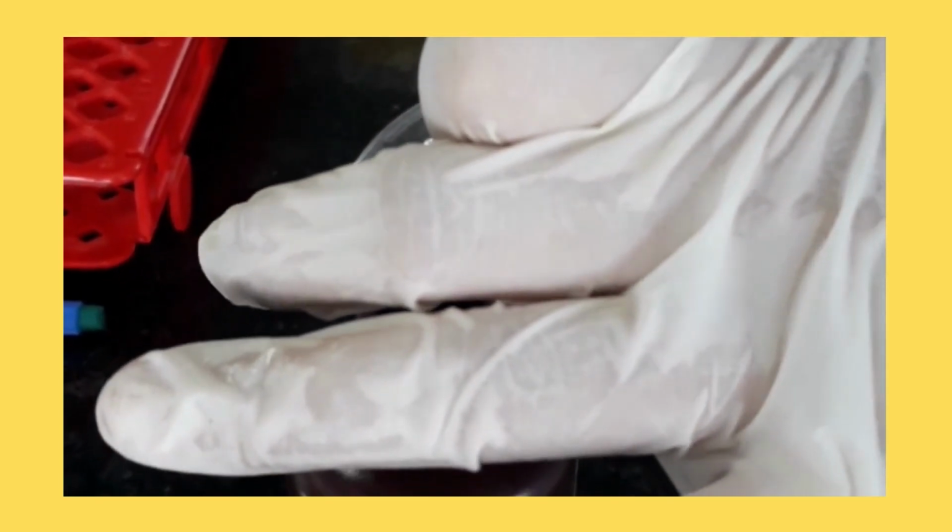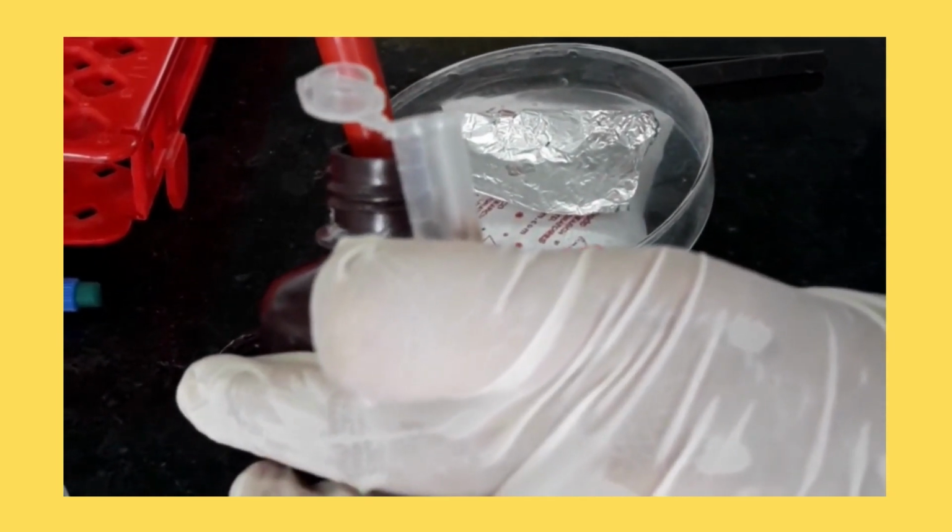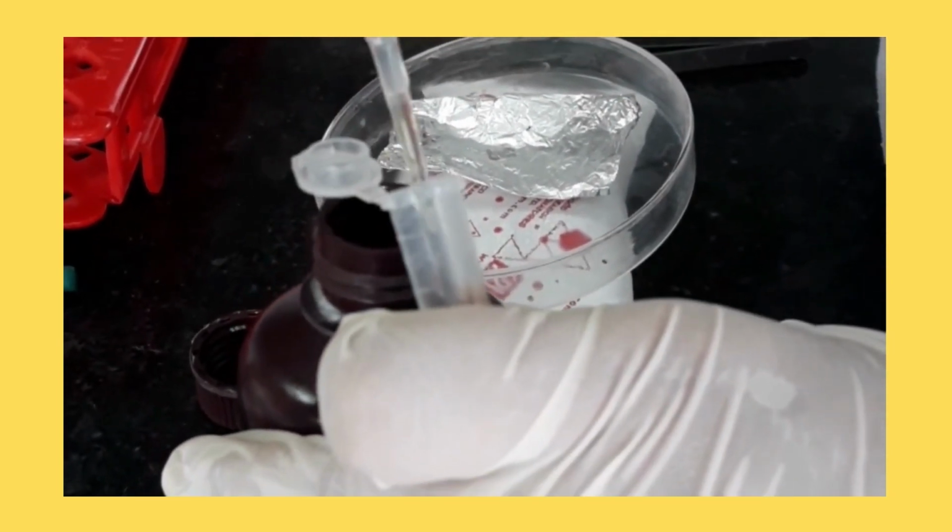After weighing the tissue, to homogenize the tissue, we add 1 ml of TRIzol per 100 mg of tissue.